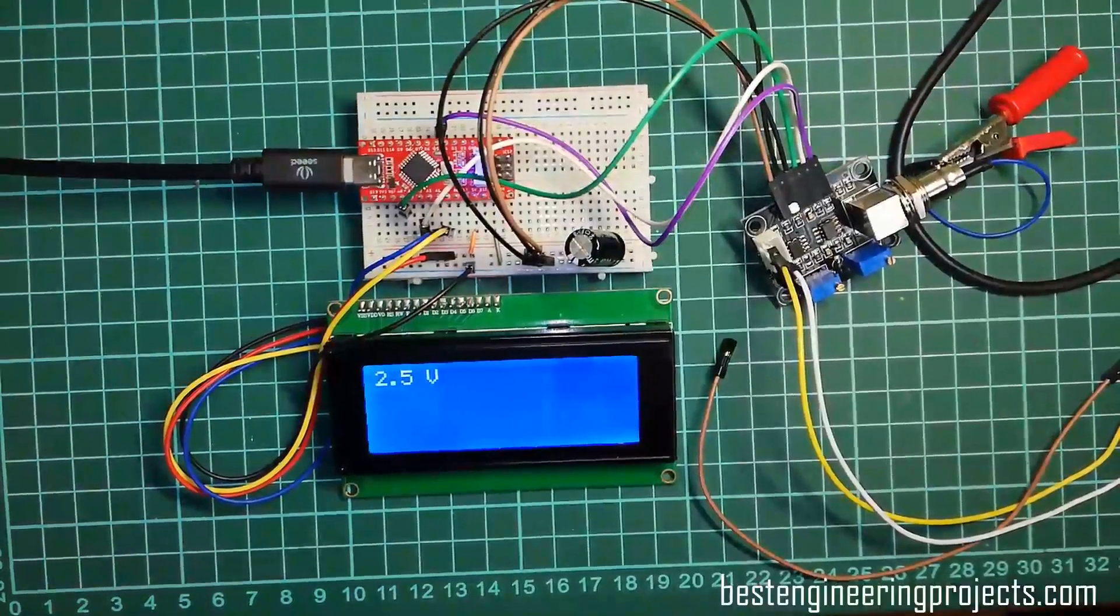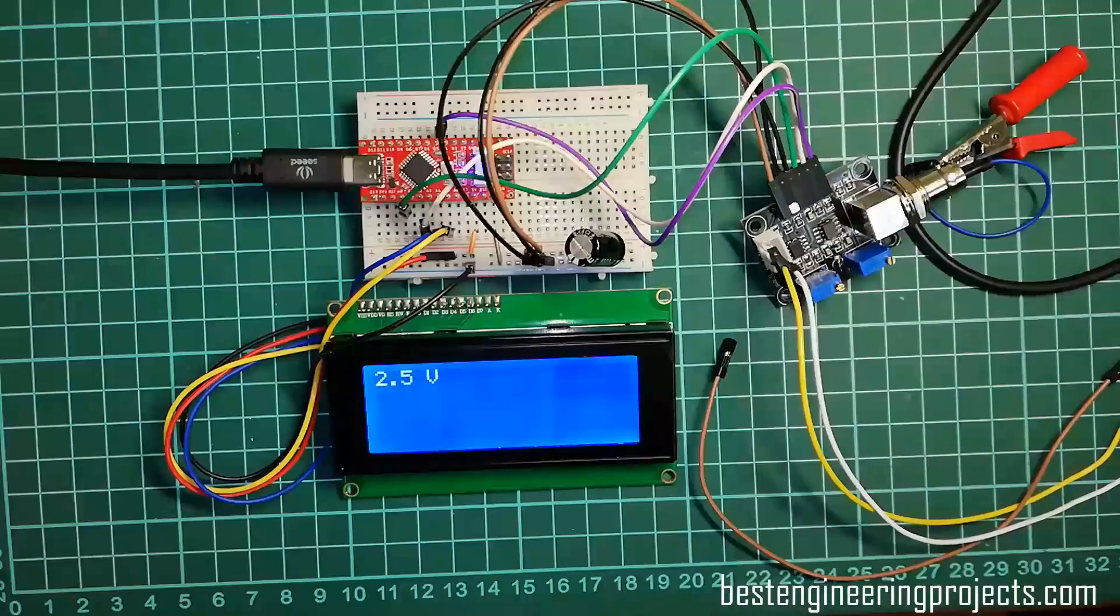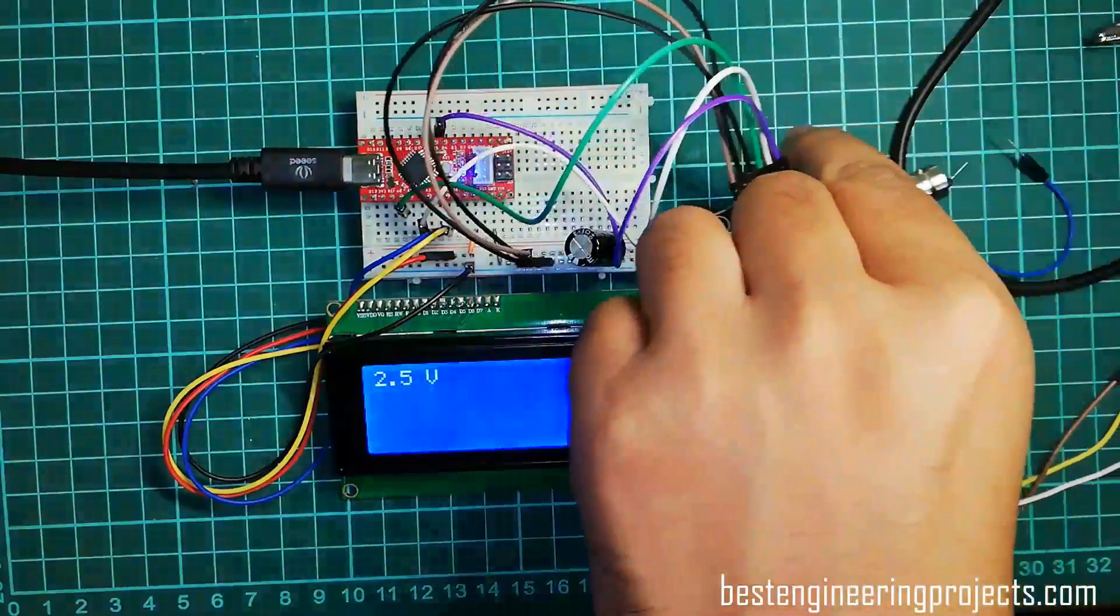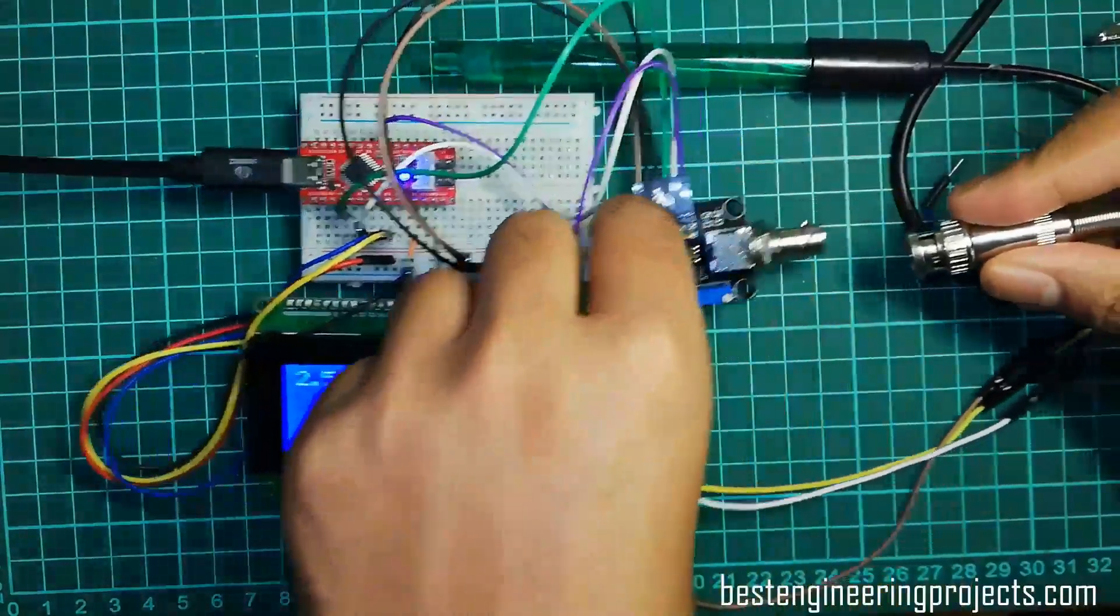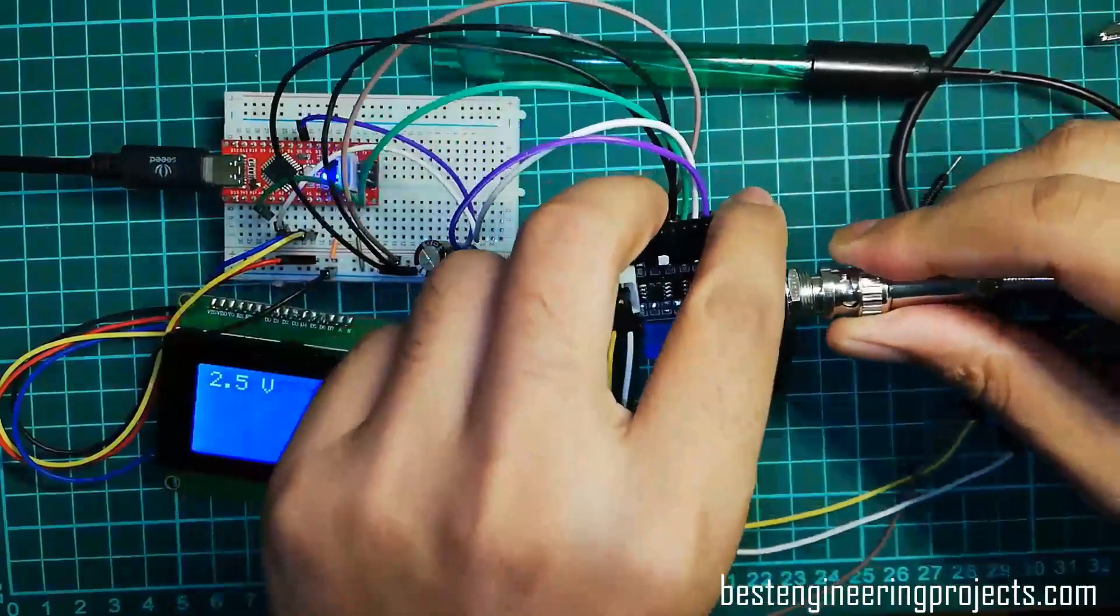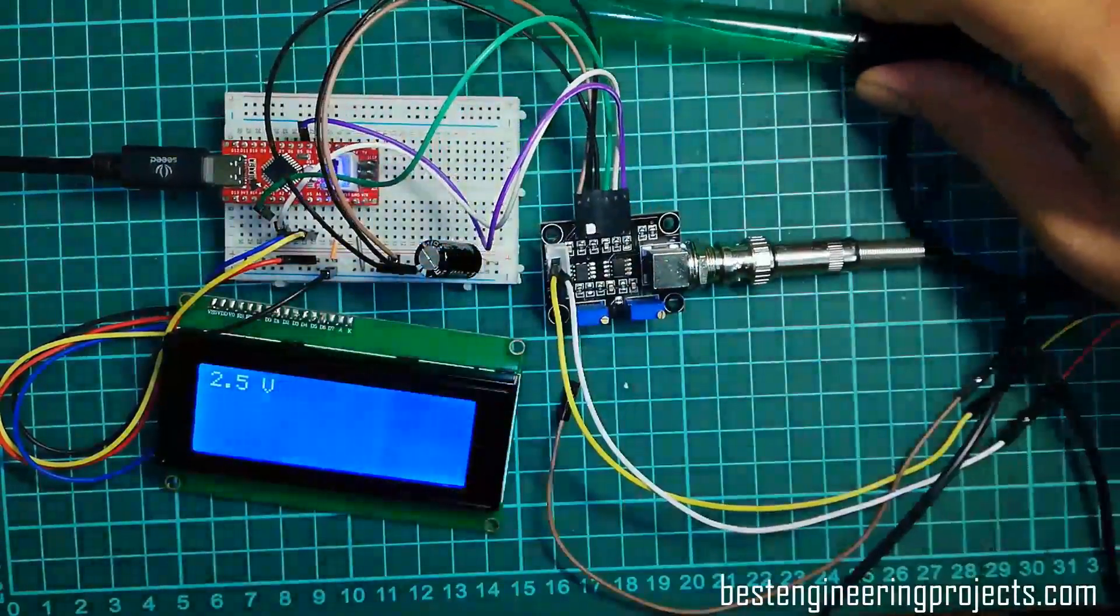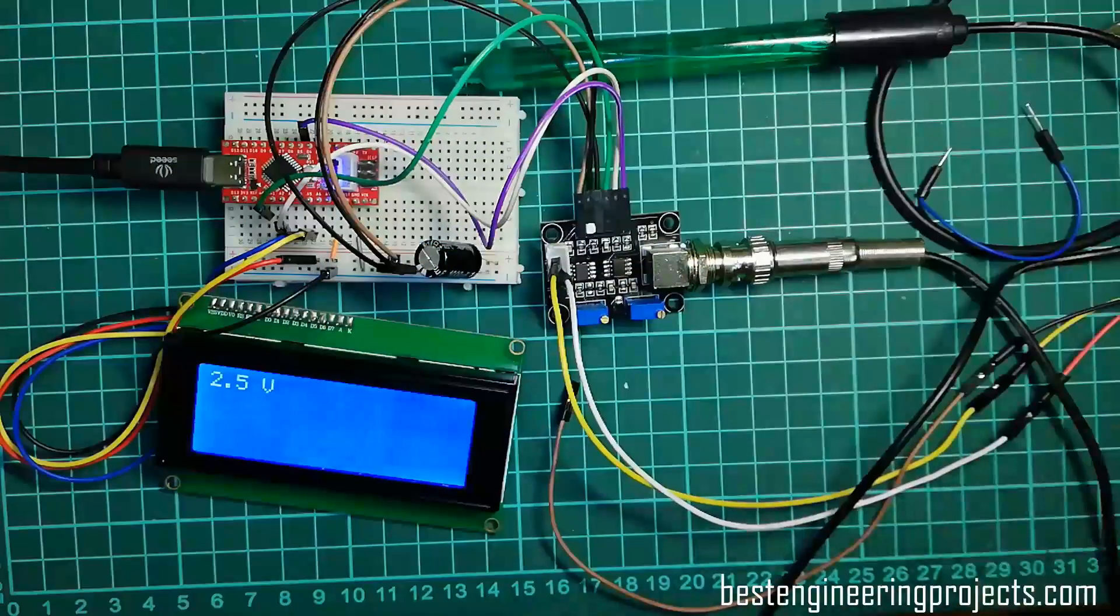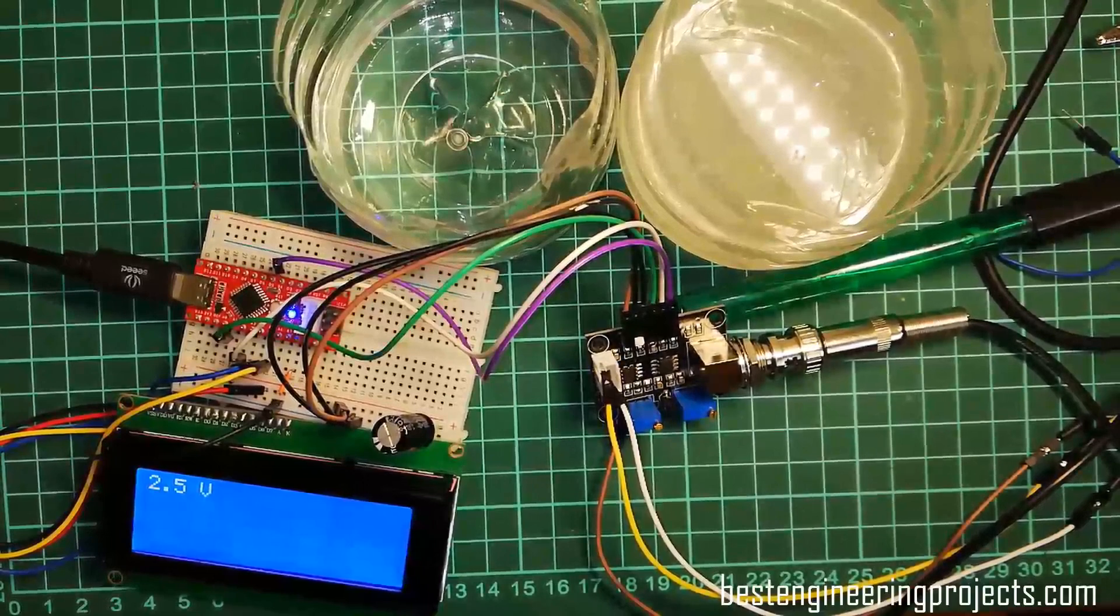After achieving 2.5 volts, I am connecting this electrode to the BNC connector and immerse this electrode into a known solution. Now, for calibration, I am taking two standard solutions.